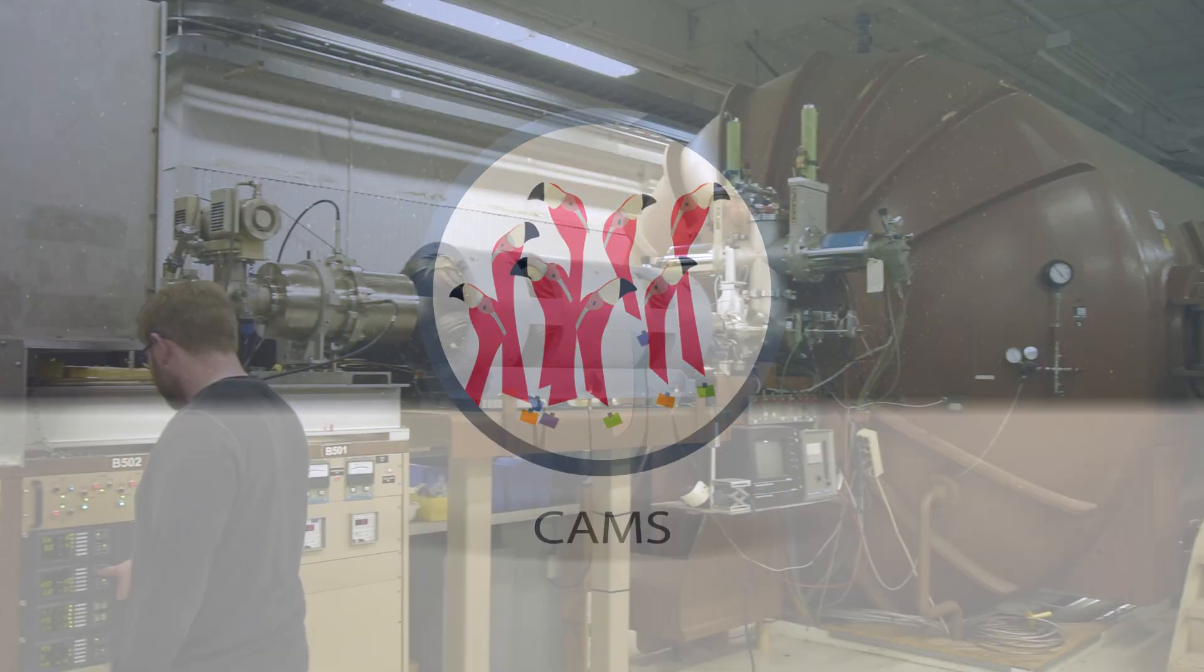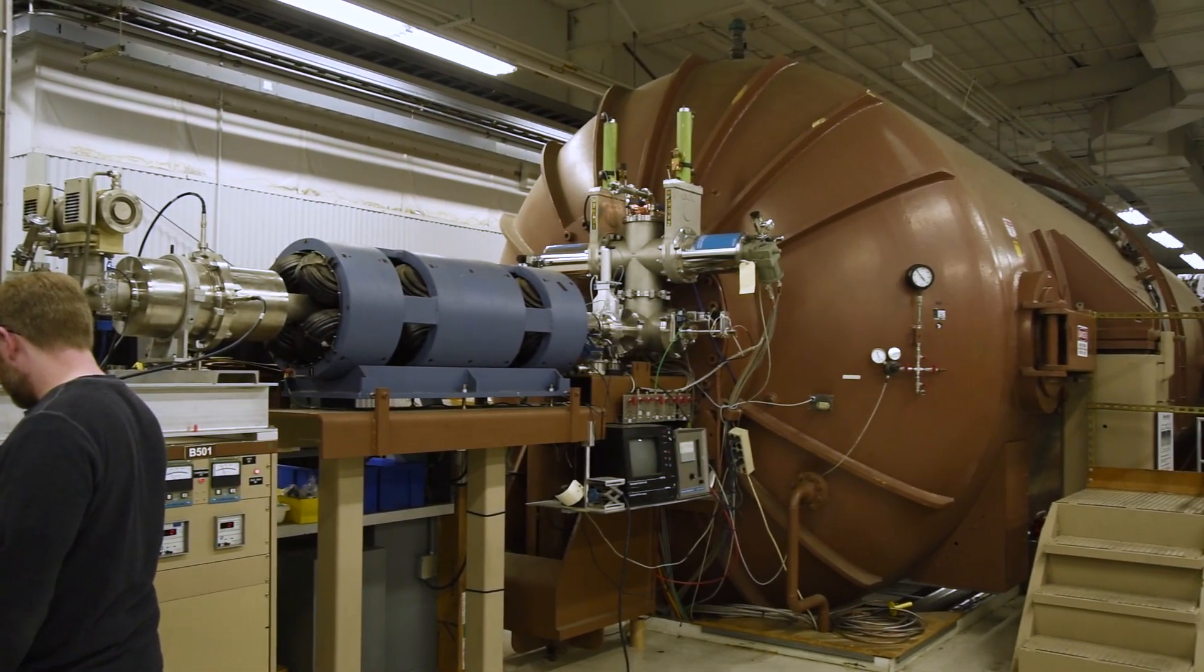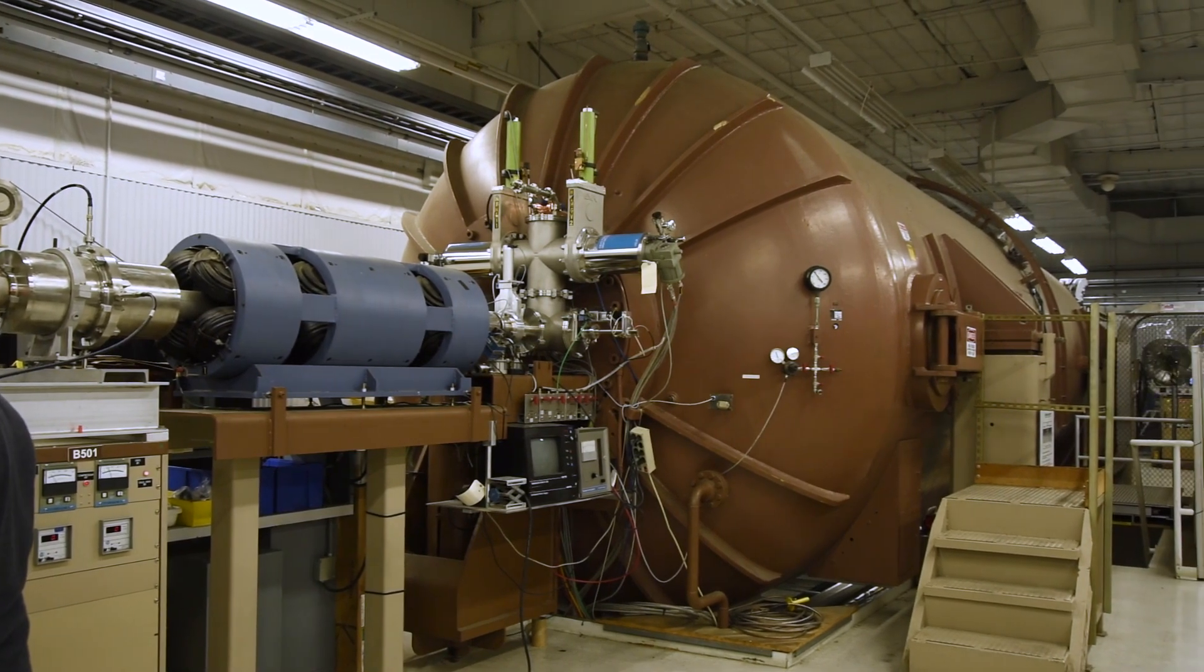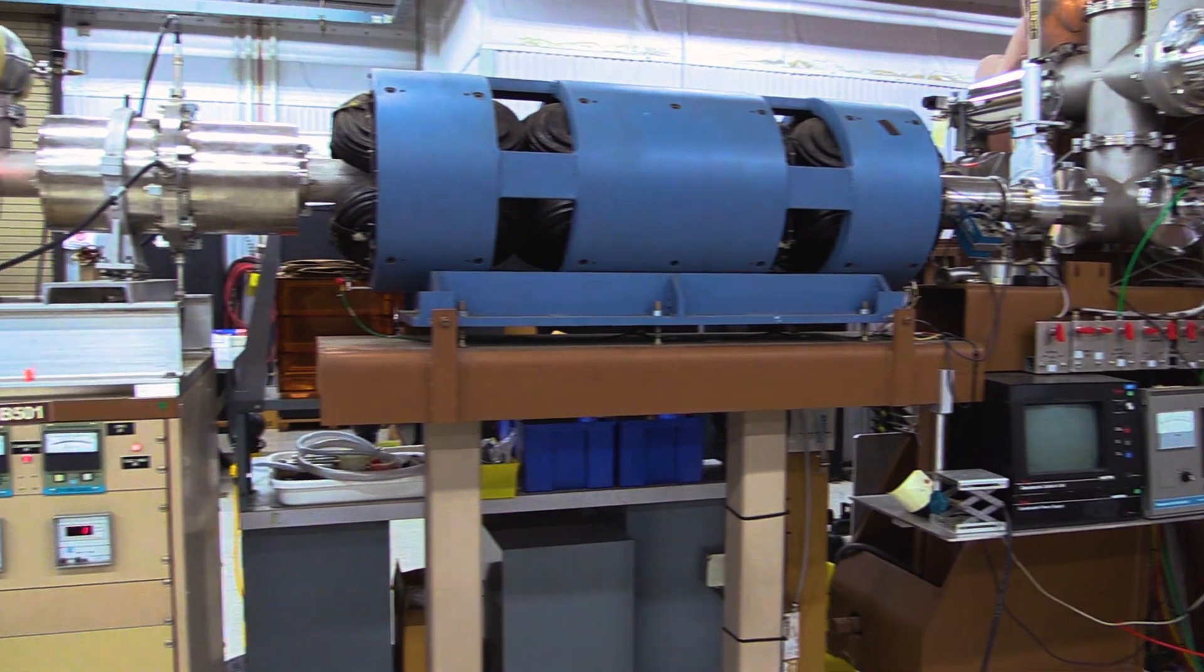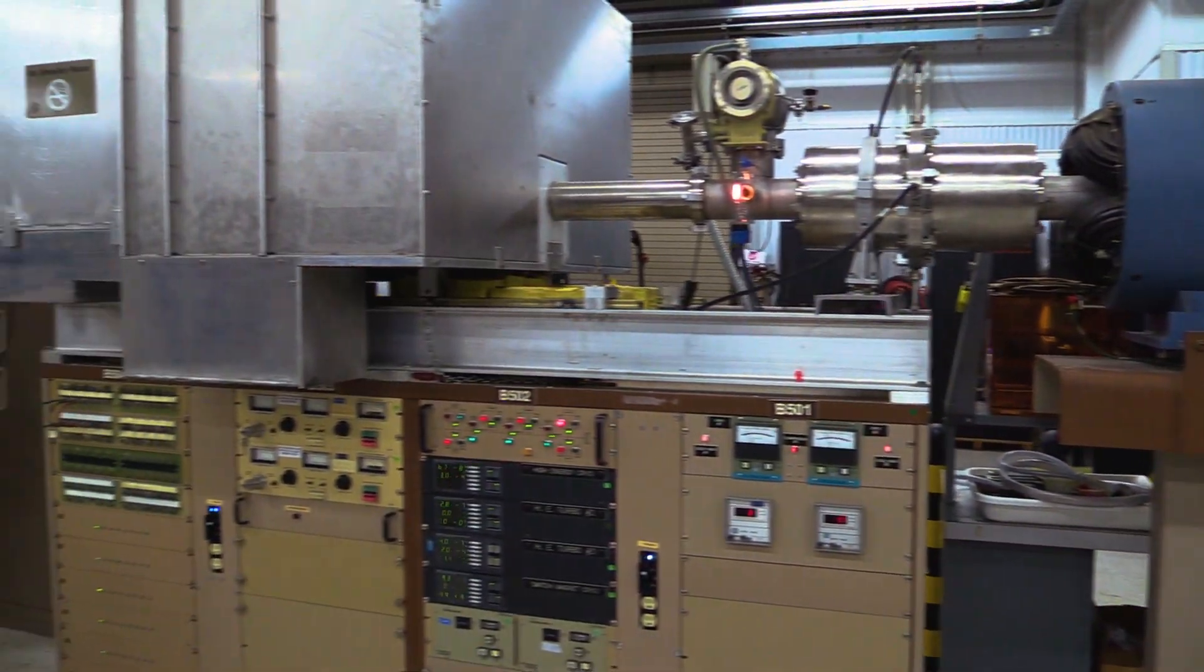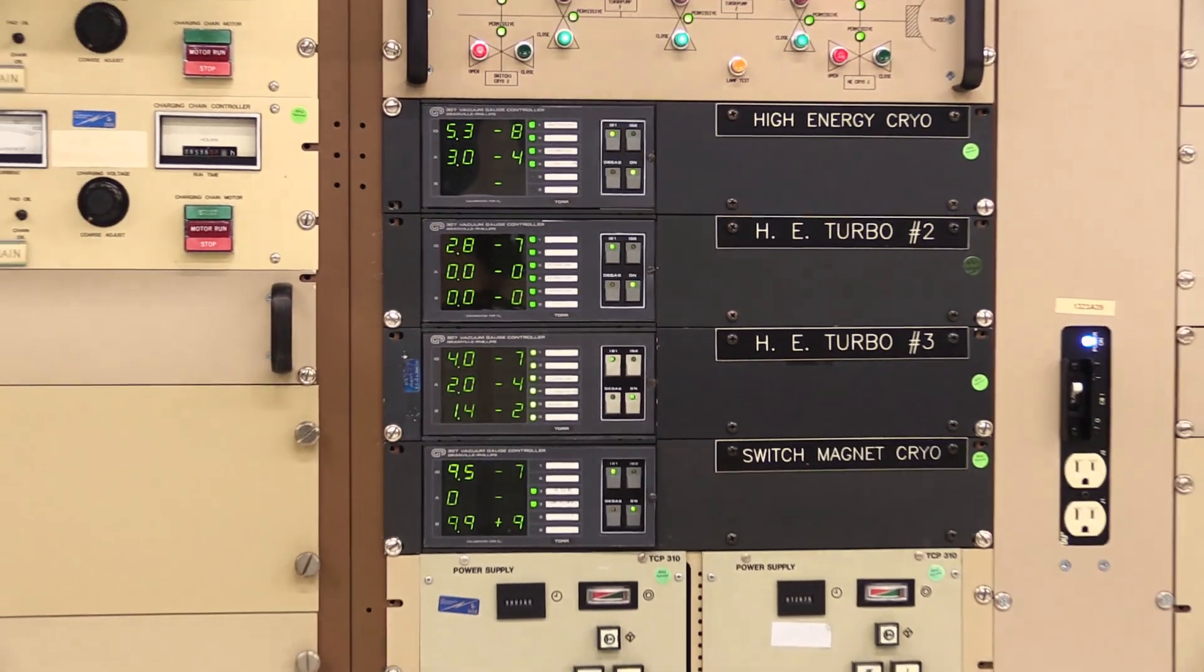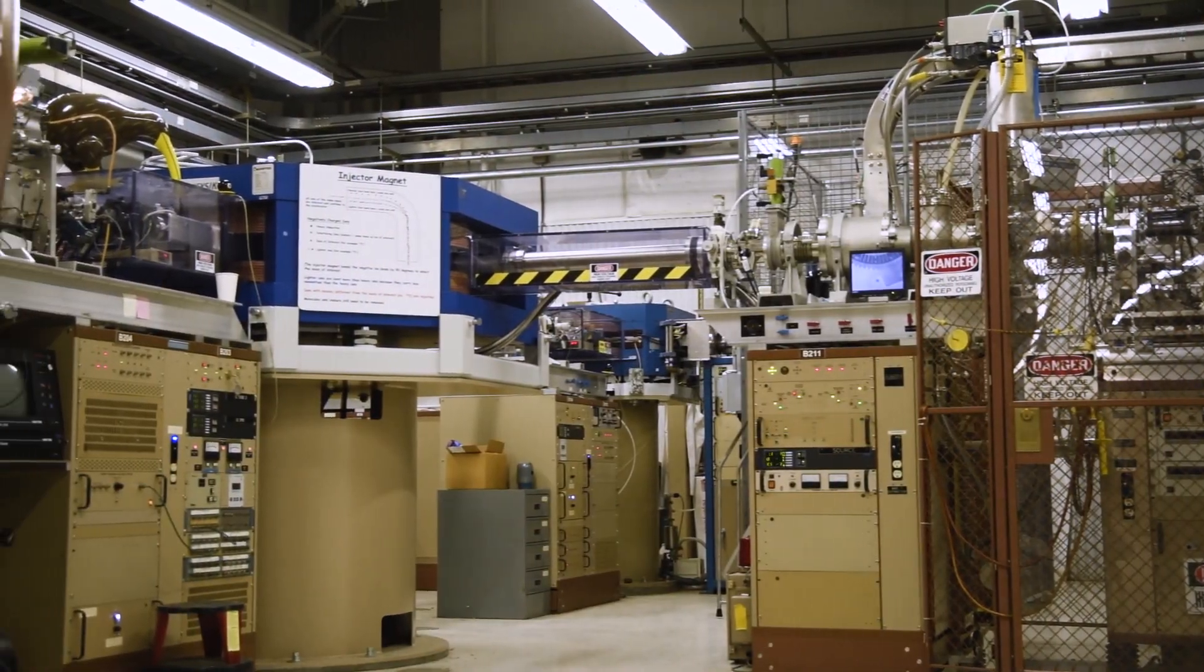The largest instrument we have at CAMS is the large brown tank behind me. It's the FN Accelerator. It allows us to take the ions from our samples and accelerate them up to tens of millions of electron volt energies, and that allows us to filter them through the magnets and other things we have and get them down to the point where we're just counting the single ions that we're interested in.